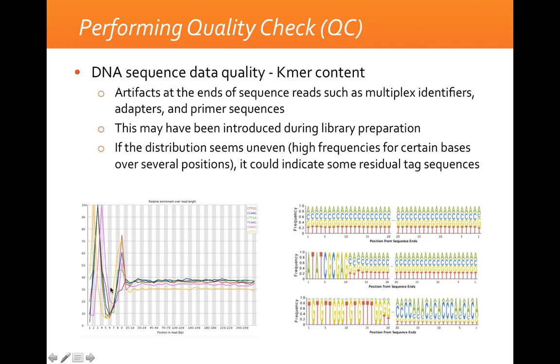So it's using the first cycles in the sequencing reaction to calibrate the machine itself. But anyway, these are artifacts that can be removed, as we shall see later, and you will also do this in the exercise.